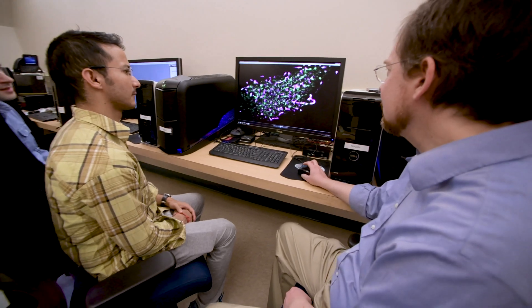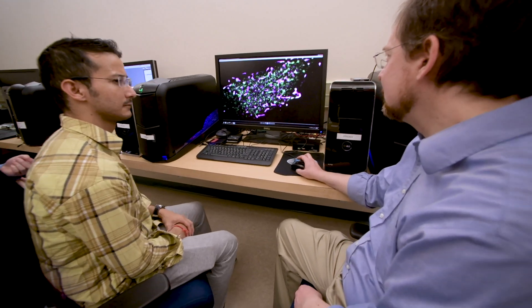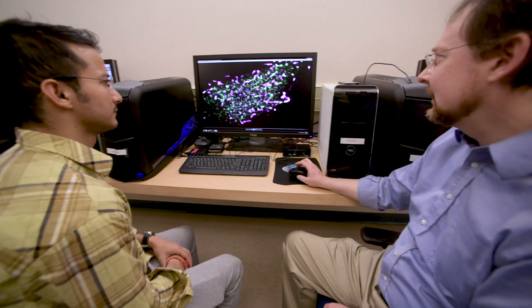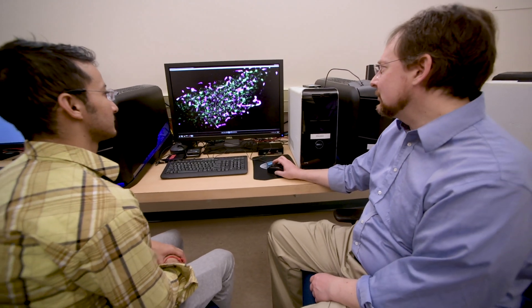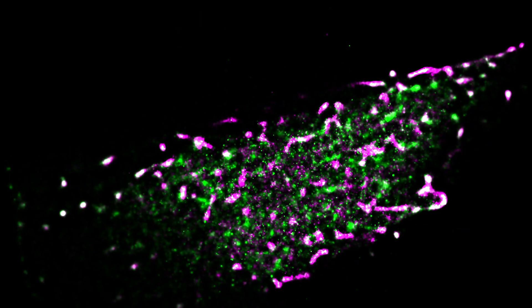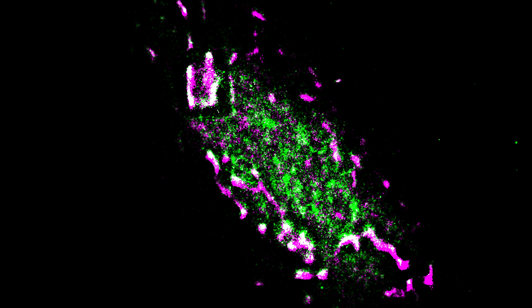This is a super resolution image of HA, the flu protein in green, and PIP2, which is the cell lipid, colored in pink. There are areas where the two are together and it makes a strongly white cluster.